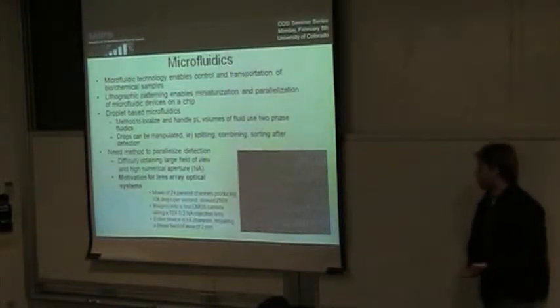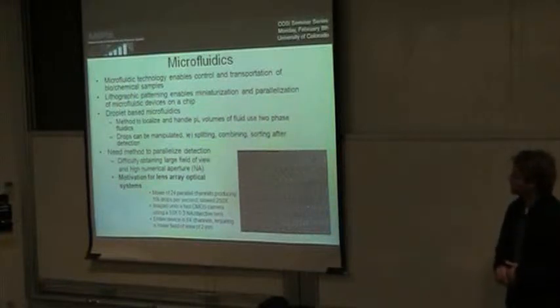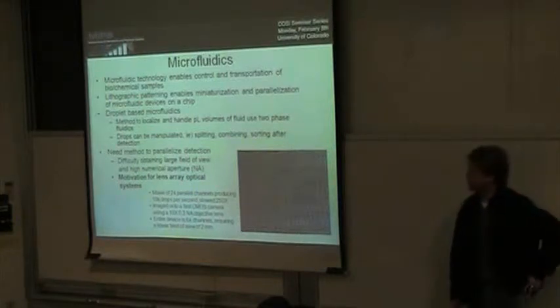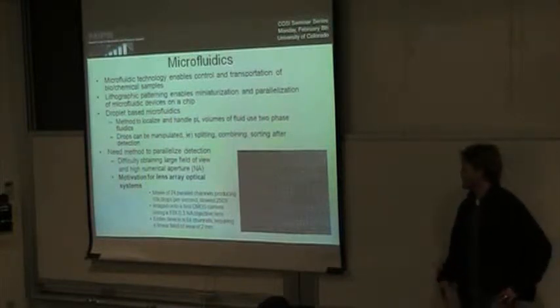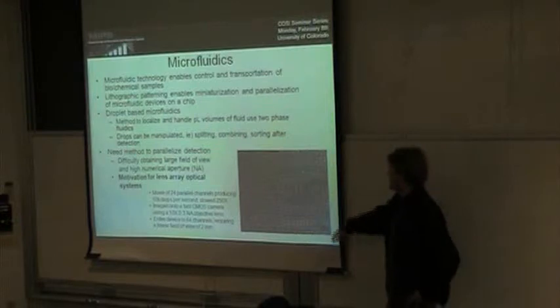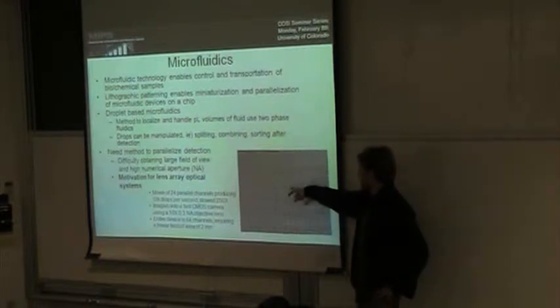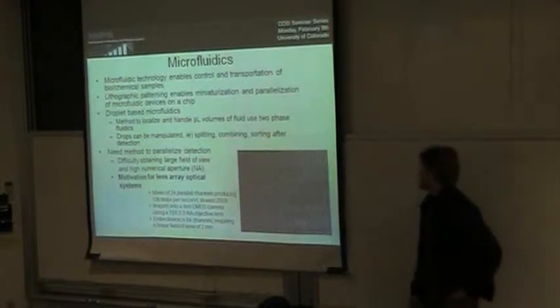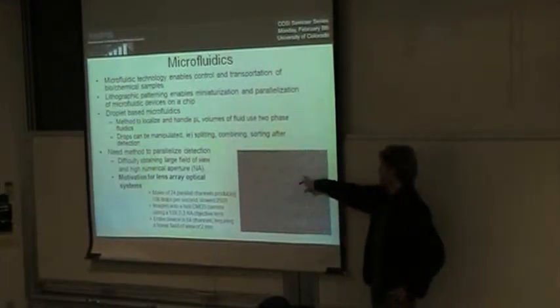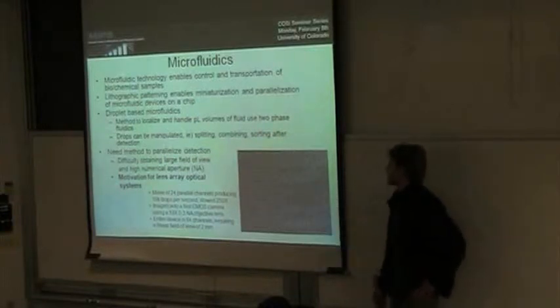So the platform that we're working on is microfluidics. It's a planar fluid manipulation platform. You define these circuits with lithography, so they're very flexible. They're very easy to parallelize, very easy to make small. So you make these microfluidic channels. They can have dimensions on the order of several microns, but these have widths of 20 microns. So this device has a pitch between the channels of around 30 microns.